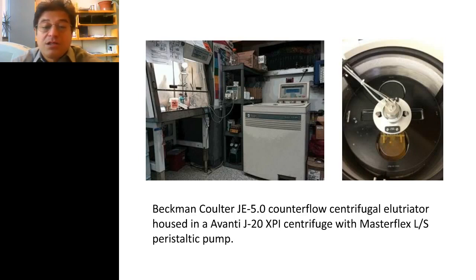In addition, in this picture you can see that we have a biosafety hood that's set up, and in that hood we can be keeping everything sterile, introducing cells in a sterile environment, as well as collecting cells in a sterile environment. So this is both for introduction as well as collection of fractions.